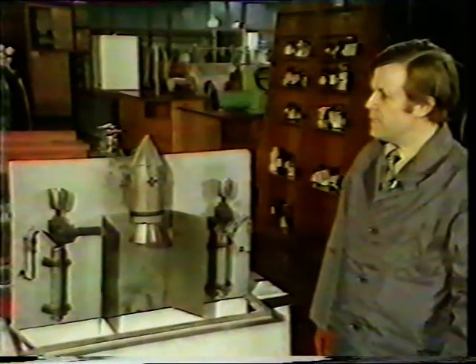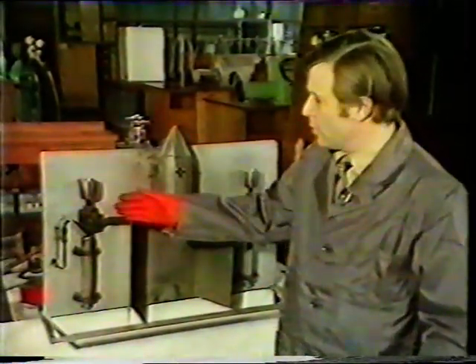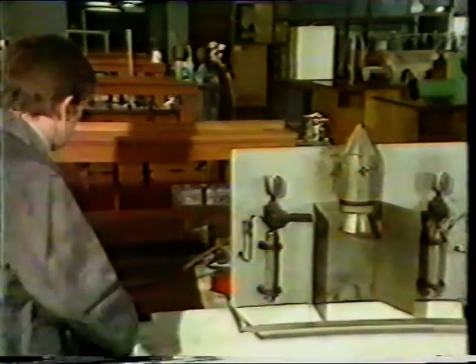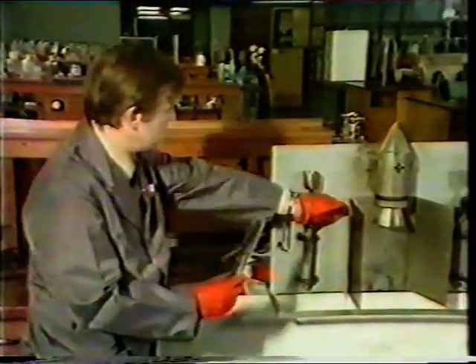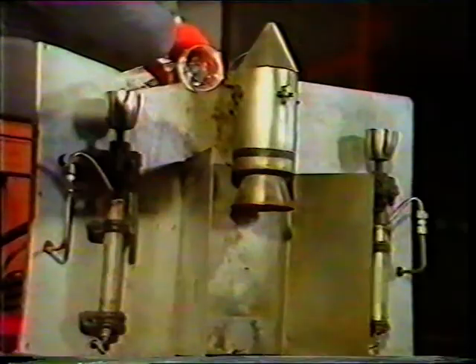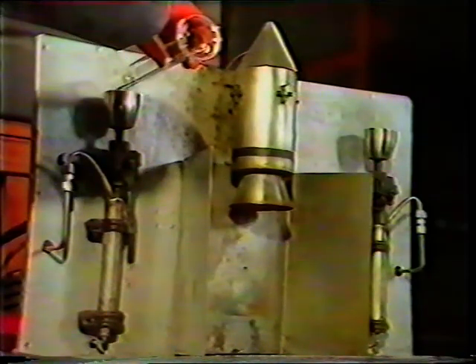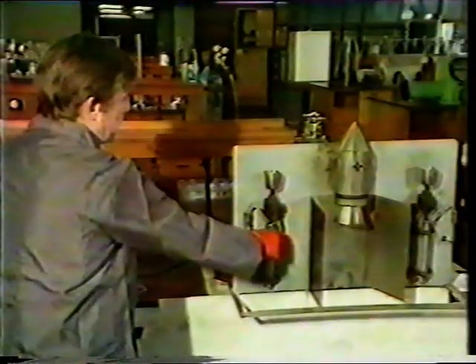And we can now demonstrate the burning of that particular fuel combination. It's necessary for us, first of all, to load the fuel tank. The hydrazine is the fuel, and here we have 30 milliliters of the fuel, which we'll now put into this tank. You can rest assured that the actual loading procedure used by the Apollo technicians is rather more sophisticated than the one which I'm using here. There we have the fuel component now loaded.